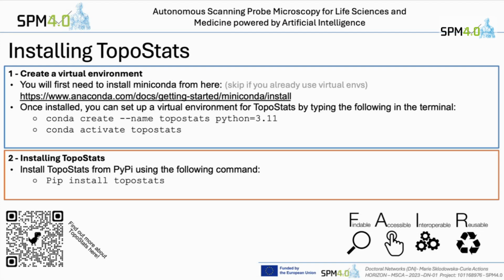So that looks different when we both look at this. Yours came up like that and yours came up like that. No, we just have your thing to look at. So I said on this one here, if you go down, yeah.